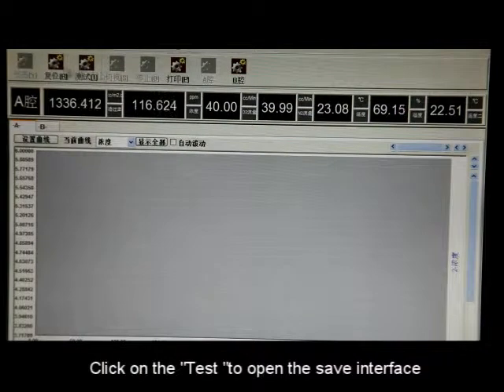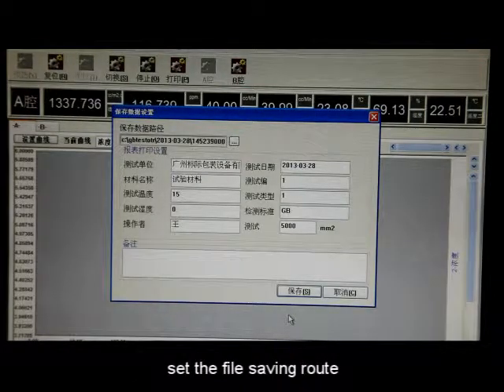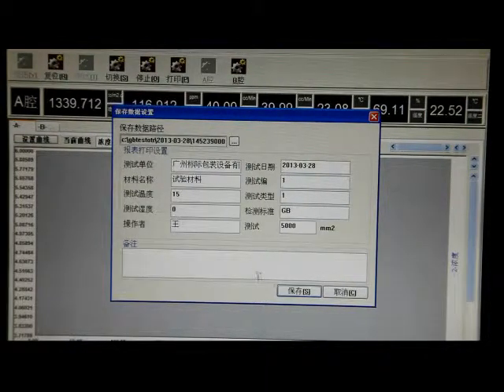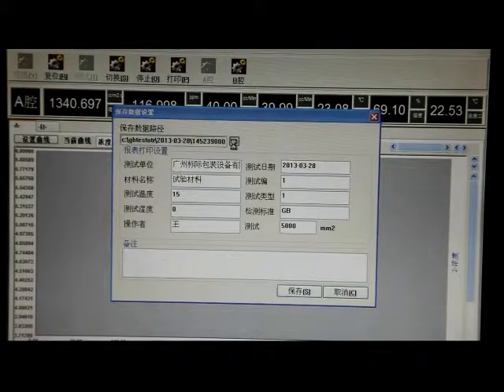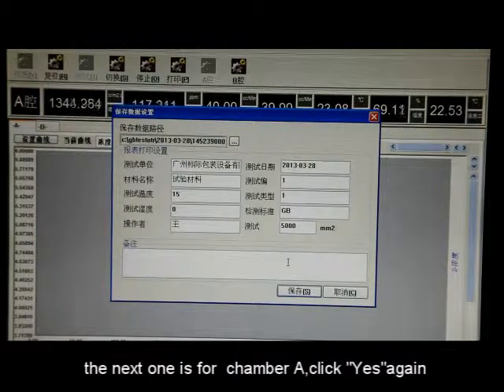Click on Test to open the save interface. Set the file saving route — the first one is for Chamber B. Click Save. The next one is for Chamber A. Click Yes twice.